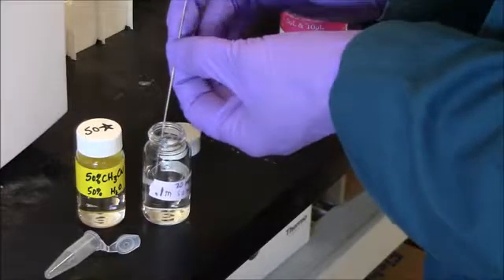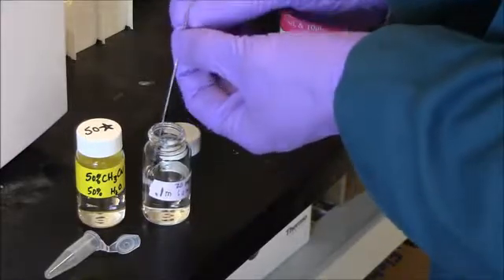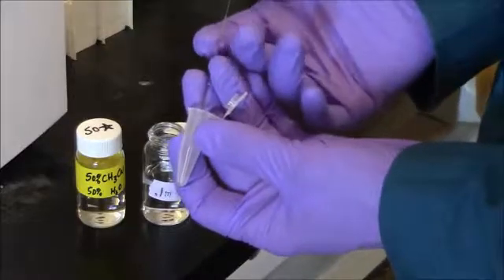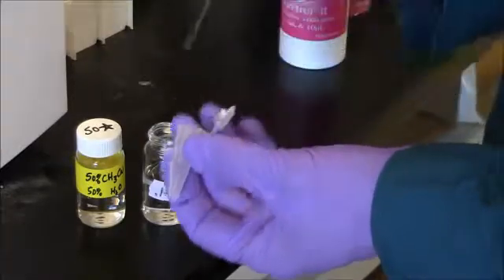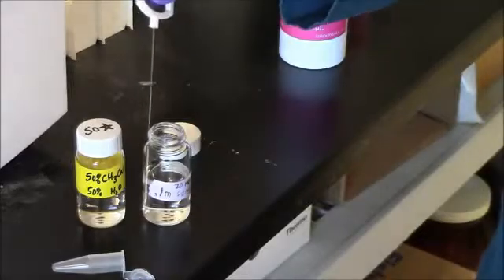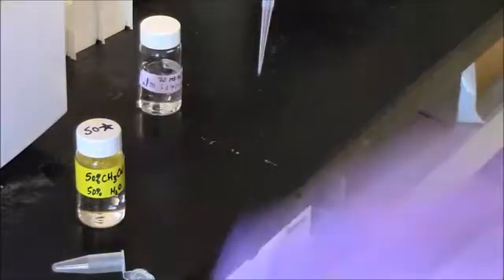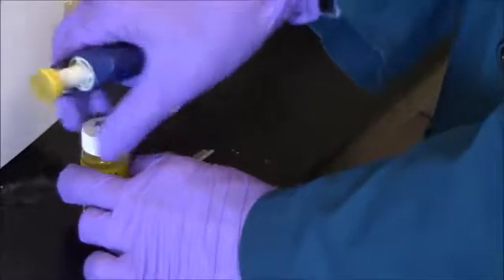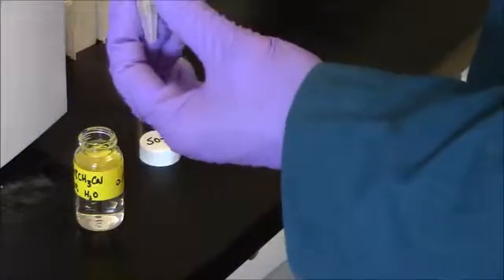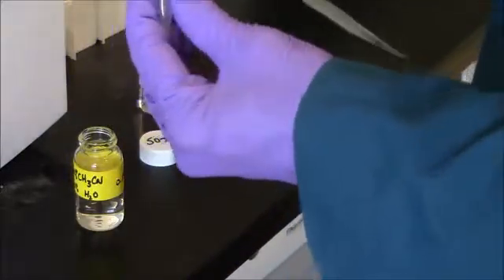I could use a P10 for this, it'd be fine, but I want to demonstrate the use of the microcapillary measuring device. And then I just push, and I have 4 microliters in the bottom of my Eppendorf tube. The capillary is throwaway. The plunger needs to be washed. So now I'll add 200 microliters of 50 star to my sample to dilute it appropriately for the HPLC.